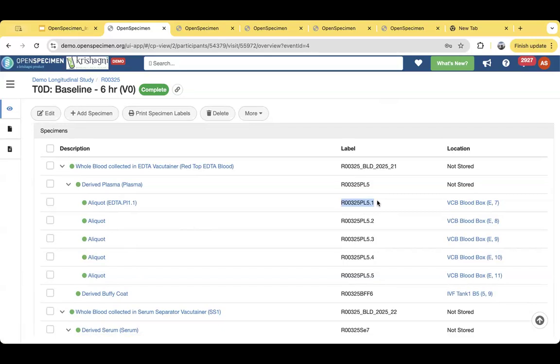You can also configure that only aliquots should be printed, because maybe you collect the primary specimens first and then process the aliquots. So based on whatever your requirement is, you can configure what kind of labels, including what should be printed on the label, because different studies want different things printed on the label. So you can define all those kinds of things in the study configuration.